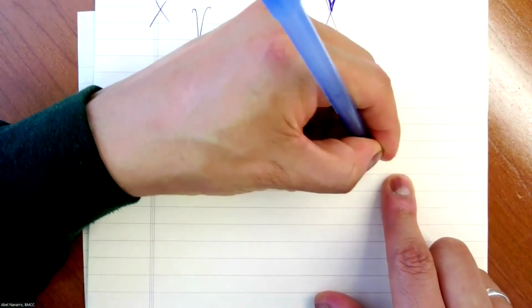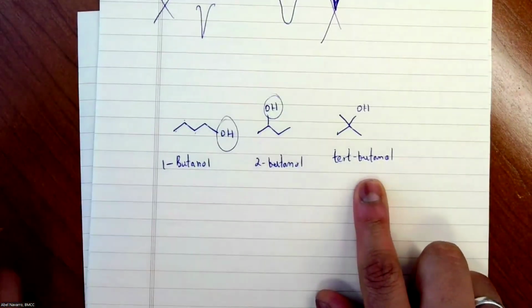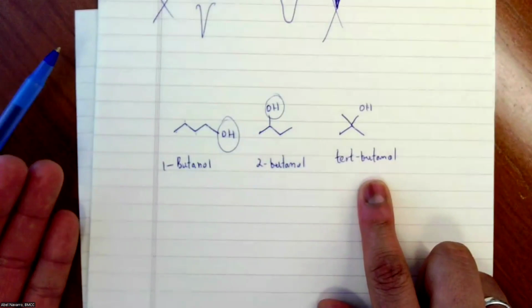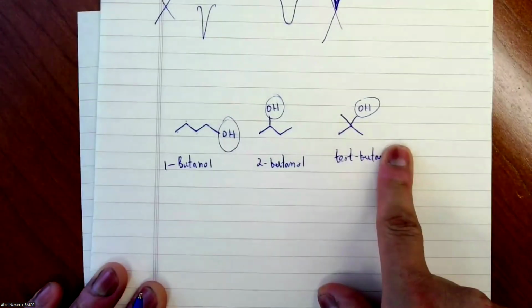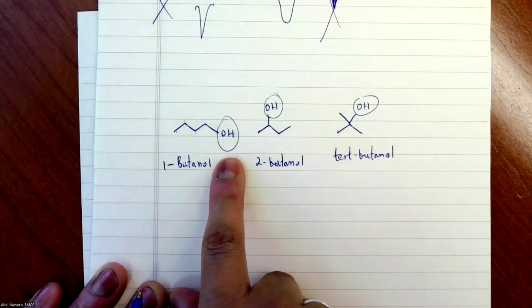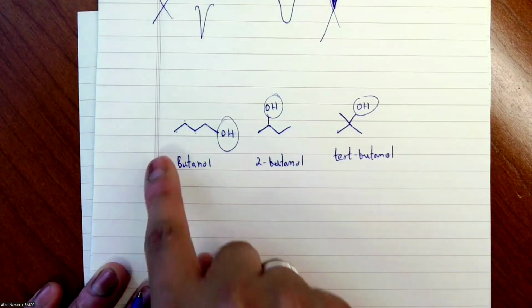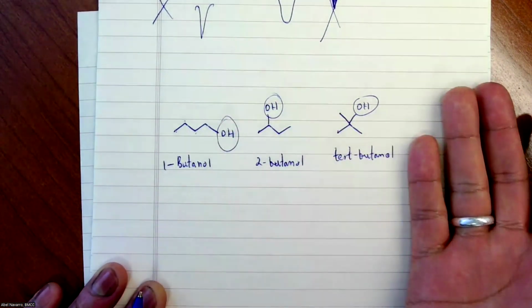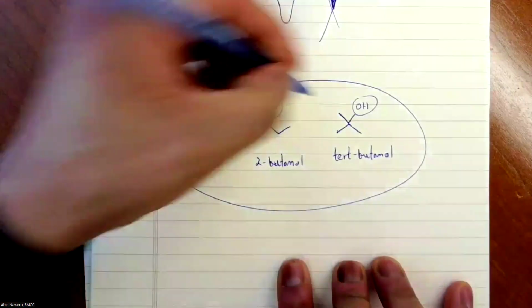By the way, don't worry about the naming yet. We haven't done naming of alcohols, so don't worry about naming. These are isomers, right? But infrared, or IR, will give me the same peaks for all 3 compounds. Here we'll have an OH bond, OH bond, OH bond, CHs, CHs, CHs, CC, CC, CC. So I cannot use it. Who is going to help me distinguish between these guys?